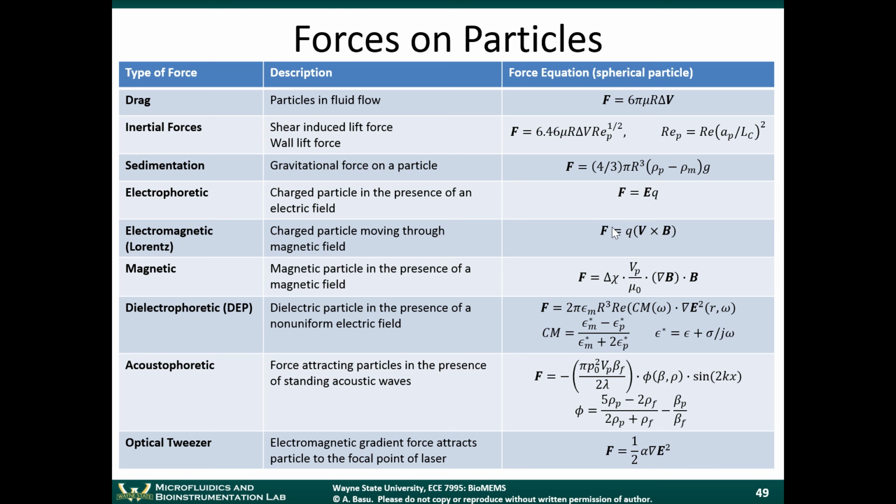Dielectrophoresis is another type of electric field force. Acoustophoretic force, particles are actually attracted to the nodes and antinodes of standing acoustic waves. So if you create a resonating acoustic wave inside a channel, the particles will actually go towards certain points in the channel that represent the pressure nodes and antinodes. A very, very interesting technique.